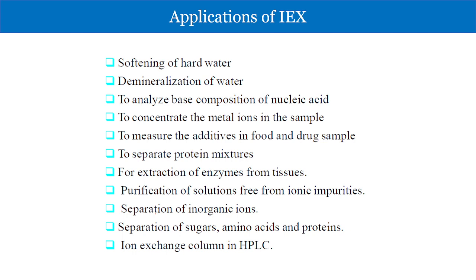So these are the three major chromatographic techniques that we usually use in daily life. Apart from that, there are many other chromatographic techniques that also carry out the separation of proteins in a better manner. But these are the commonly used chromatographic techniques, and the different applications of these techniques in the different aspects of biological molecules or the separation techniques.